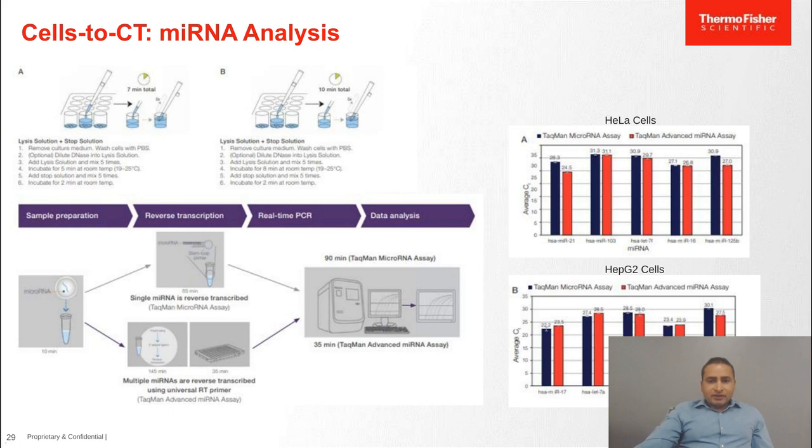So here you can see on the two graphs on the right, with two different cell types, you do get accurate and robust measurement of microRNA, which can be achieved with either of the two workflows you choose to study microRNA with.